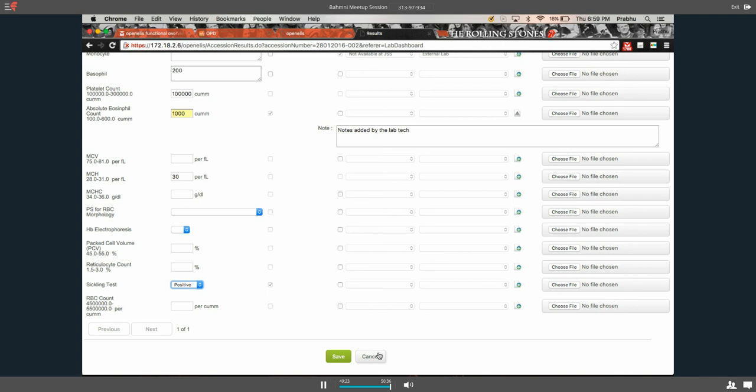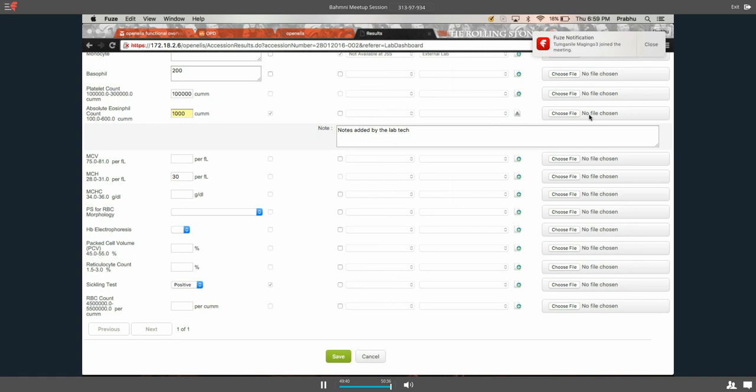They don't want to put in 0 because that just wasn't possible. They wanted to be able to say really less than so and so, because we haven't actually measured what it is, but we know it was less than a given number. Those are the two cases I've seen.